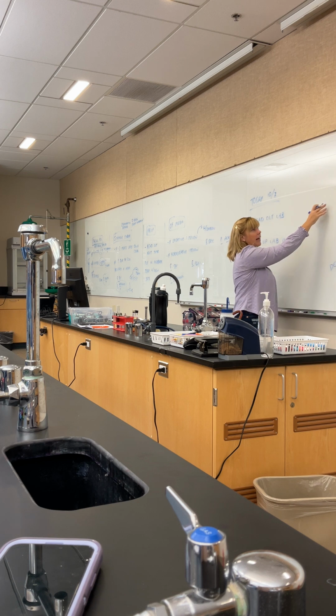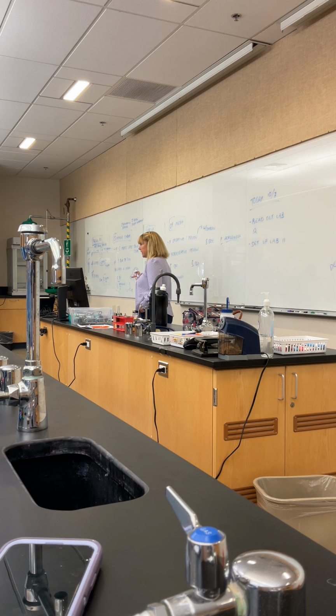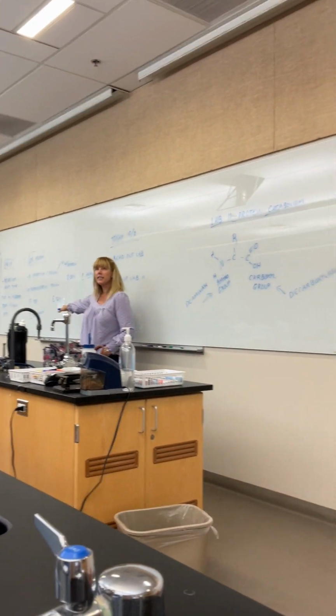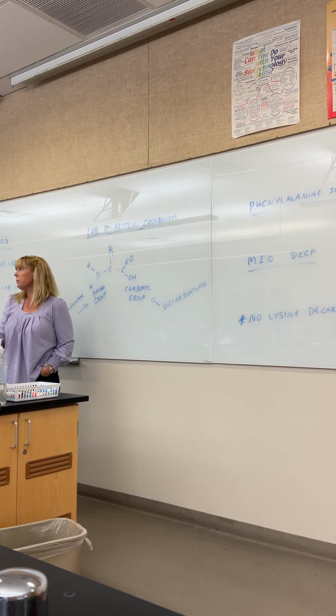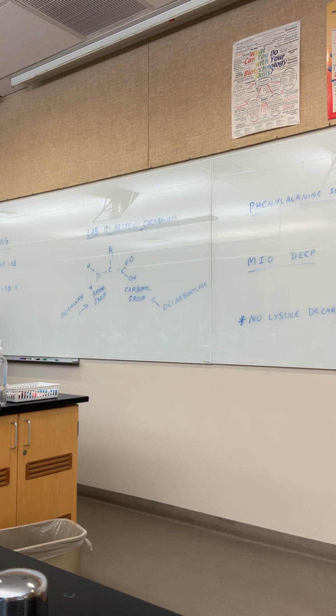Okay, today's lab is going to be setting up protein catabolism tubes. So just like what we did in lab 12, we were looking at organisms that were able to break down carbohydrates. In this case, we're going to be looking at organisms that are able to break down proteins. Now, depending on the enzymes that I have, I will break my proteins down in different ways, all right?